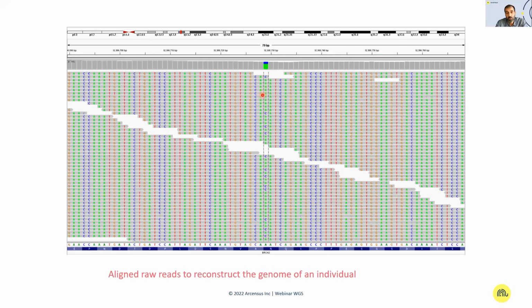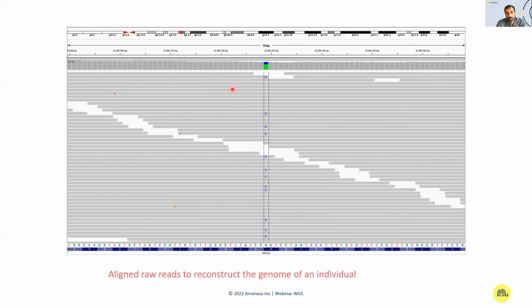And once the sequence is obtained, the sequences, what are also called reads, are aligned to the reference genome. And this is more or less how it would look. However, since this is a little bit harsh on the eye to read, it is shown in a different way, to only illustrate what is actually different between the sample of interest and the reference. So we only display the differences between the reference and the sample of interest.